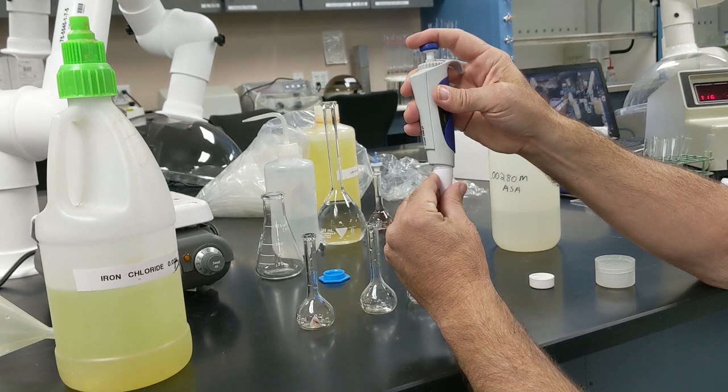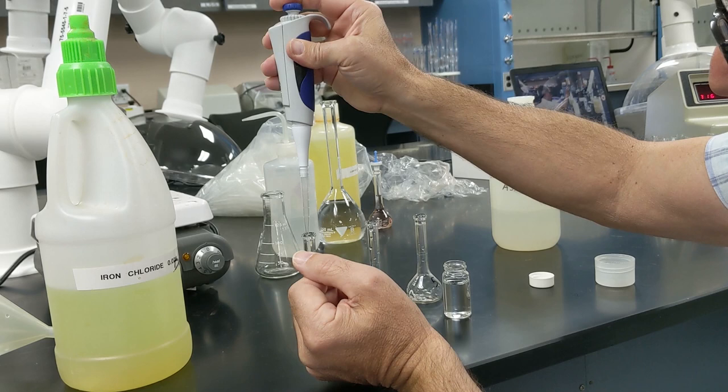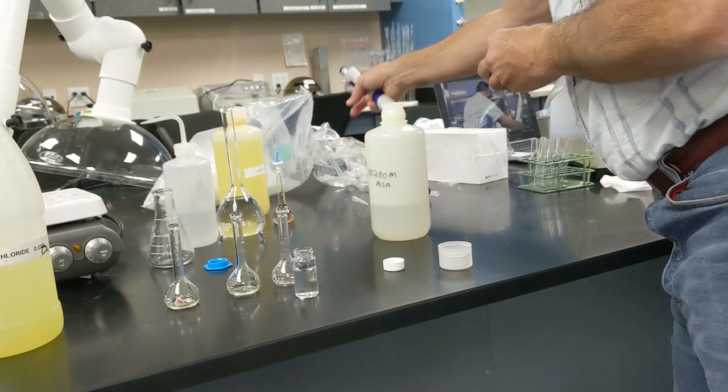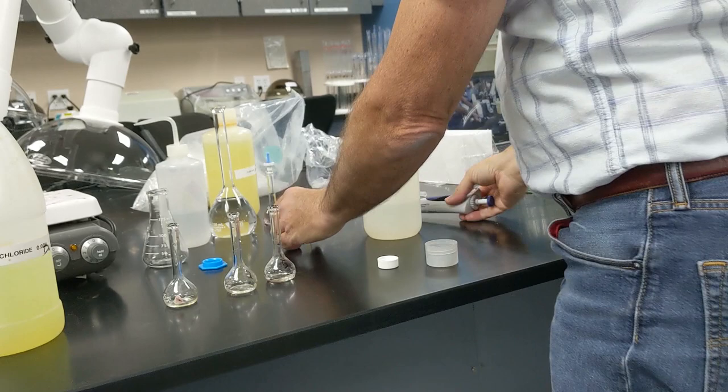So to flask number 1, I'm putting 1 ml in. To flask number 2, I'm going to give it 2 shots, so it'll get a total of 2 mls. And then the third flask, I'm going to put 5 mls of the standard in. And now each of these, I'm going to dilute to the mark with the iron chloride solution.